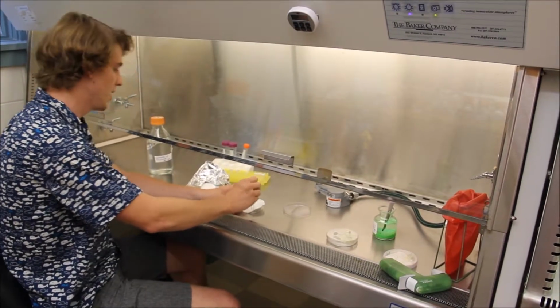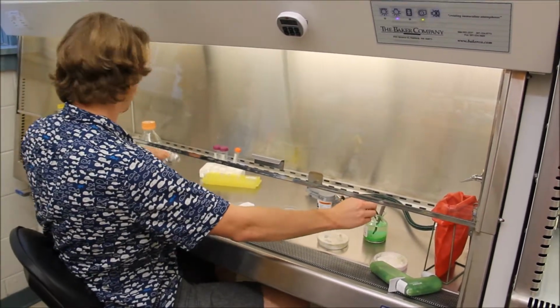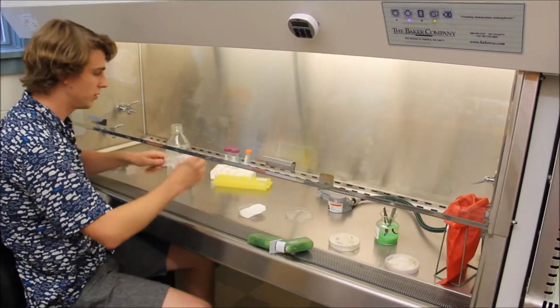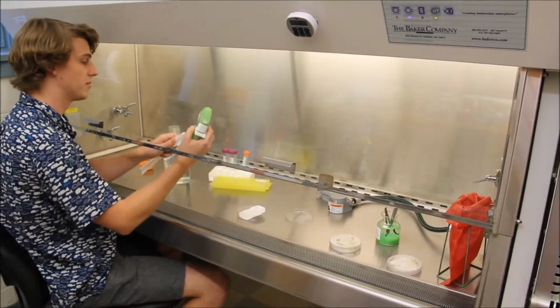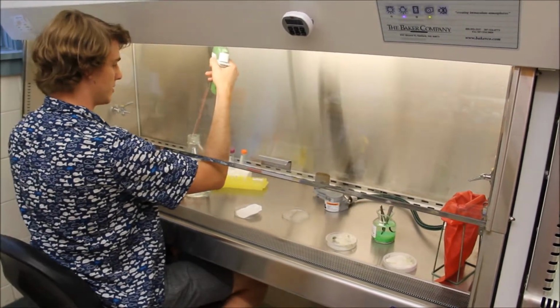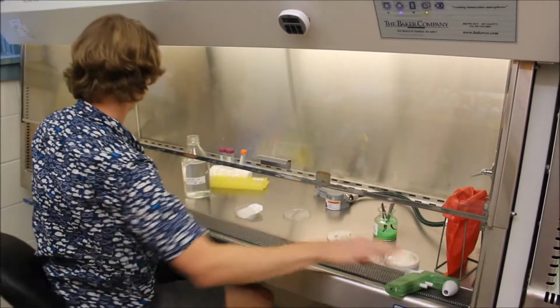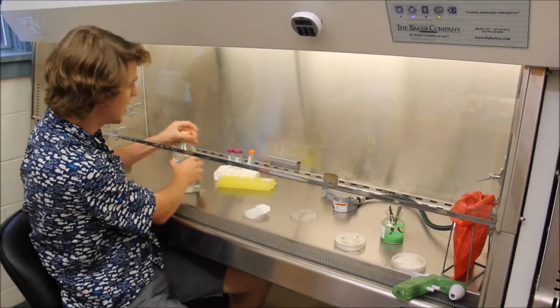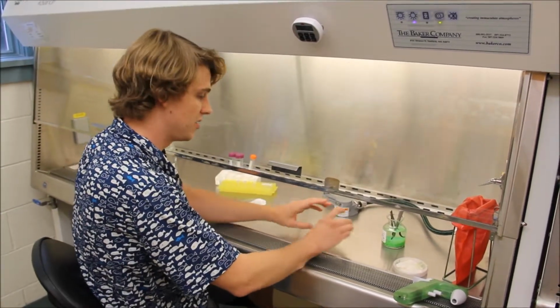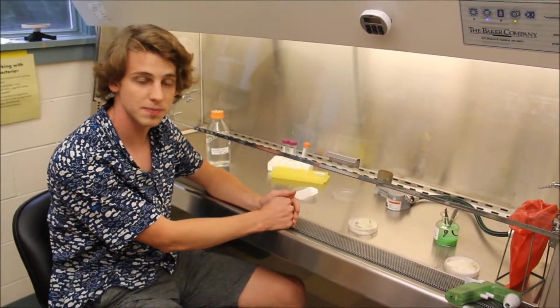compound called acetosyringone. And what this compound does is activate the virulence of Agrobacterium, thereby allowing us to have better infection. So it's the same as the normal germination and co-cultivation medium, but contains 100 micromolar acetosyringone. So once again, you use 4 mils. Just put it on there. And our Agrobacterium will be resuspended in PB buffer plus acetosyringone, just to also help make sure it gets activated too for transformation.